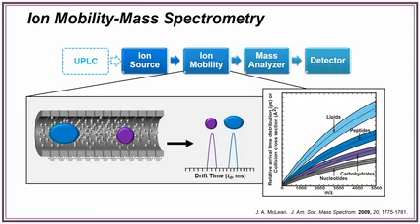They have fatty acyl tails that elongate in one direction, and they have head groups that can swap out. So there are some shared structural properties within each of these biochemical classes that determines their relationship between size and mass. And so that's one thing that's really important to think of: there's this common idea that ion mobility is orthogonal to mass spectrometry, and it's not. There's actually a relationship between size and mass, right? So, to some extent, you would expect the size of something to scale as its mass goes up.